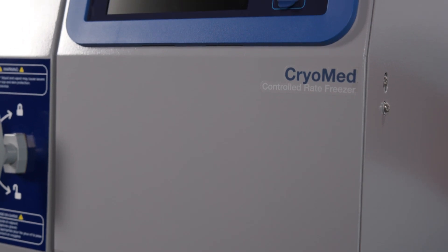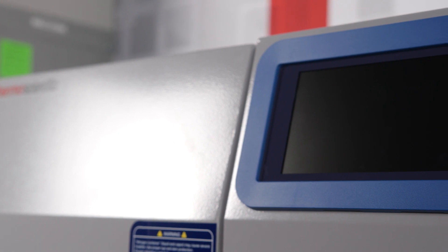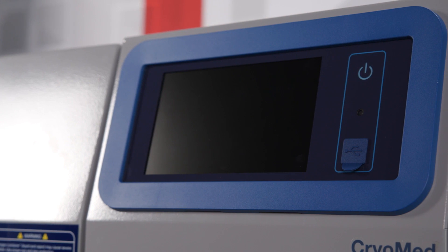I'll be going over the three methods of connecting the new Cryomed with OPC UA, but first I'll share a bit more about the new touchscreen user interface that meets 21 CFR Part 11 regulations.